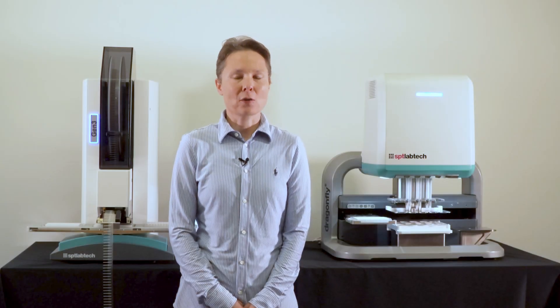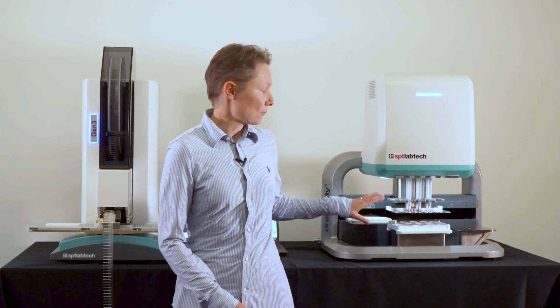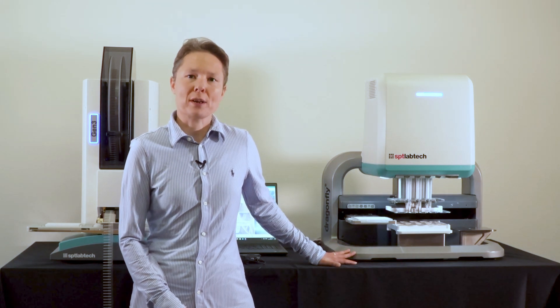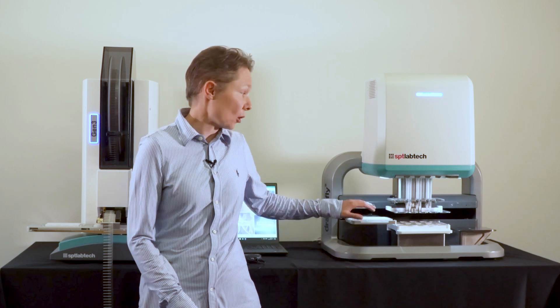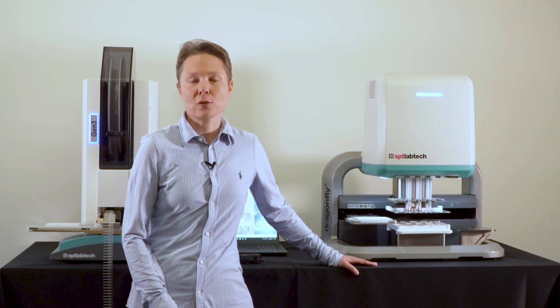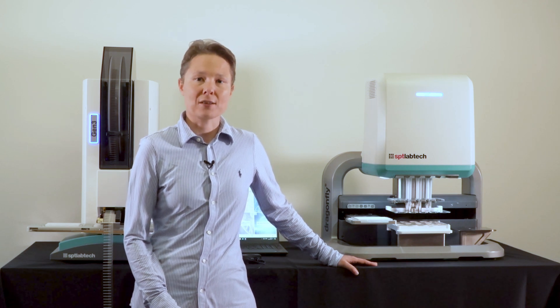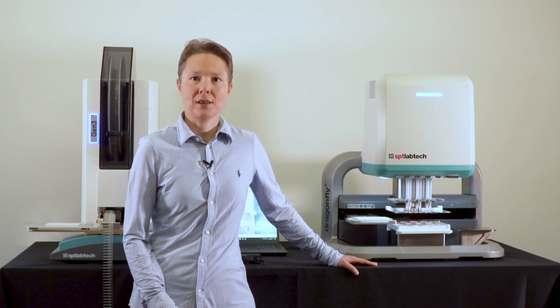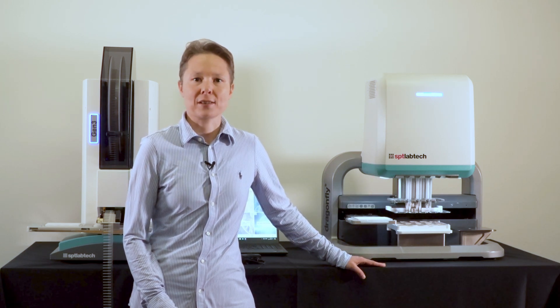For scientists looking for even more flexibility, we have a complementary solution: Dragonfly Discovery. It is an ideal companion for the Mosquito instruments, which can replace tip-based reagent additions with non-contact dispensing from individual syringes. Similarly to the Mosquito, it is based on true positive displacement technology, allowing accurate and precise reagent transfers at volumes as low as 200 nL — which is an ideal volume range for miniaturized NGS protocols.